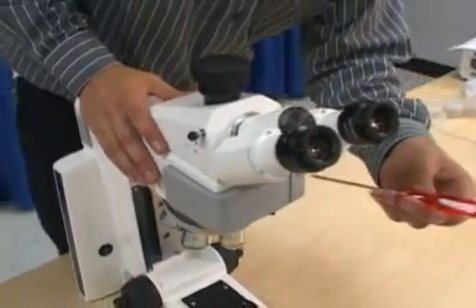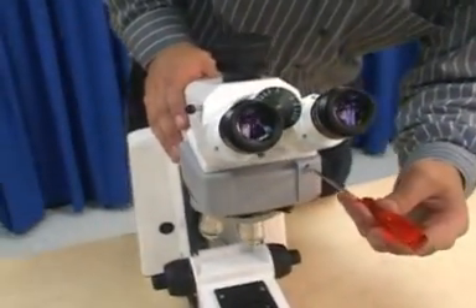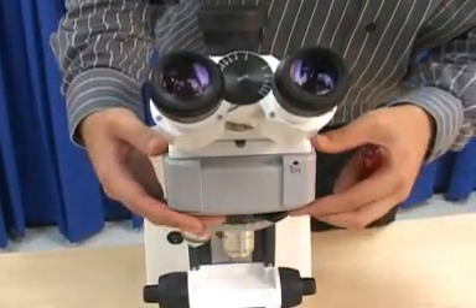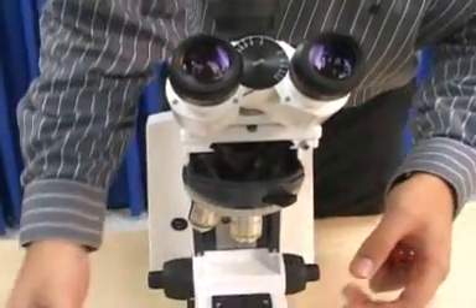Remove the plastic turret cover from above the nosepiece by inserting the ball-headed 3mm screwdriver into the hole in the front of the cover. Turn the locking screw counter-clockwise and pull the cover out.